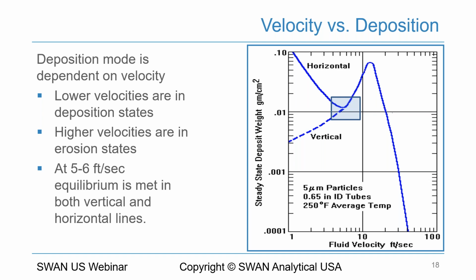Anytime we get above that, if we did not cool the sample or correct the temperature via temperature compensation, we would want to make sure that we were protecting the instrumentation. So anytime we're dealing with extremely warm water, or especially steam samples, it would definitely be a recommendation that we have the thermal shutoff valve.